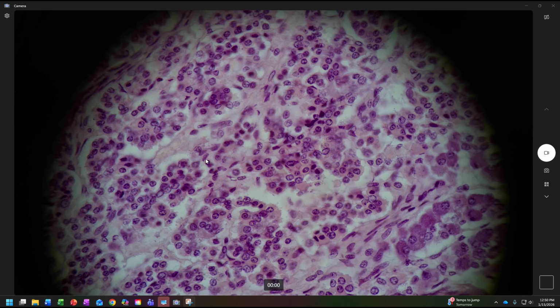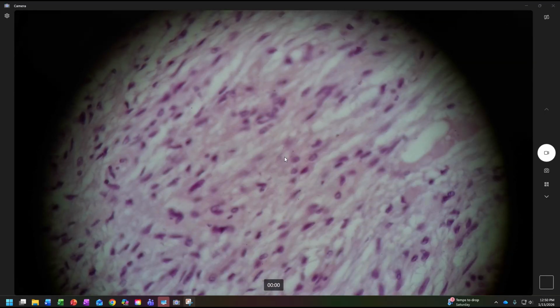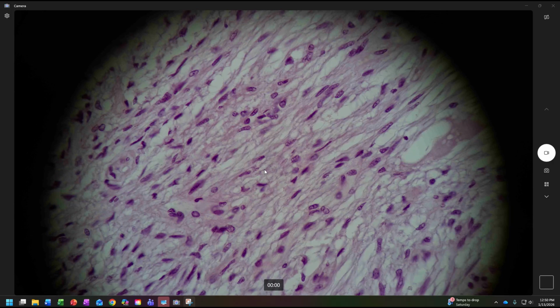Again, these little specks here, those are all individual cells. Those darker ones are the nuclei of individual cells. But we can see they're packed tightly together. That gives them the grainy appearance. That gives them that denser, darker look. And if we go over again, I think it was over this way. Yep, there we go. Again, we can see the wispiness. Again, cells not so packed tightly together. Therefore, that gives that a lighter, less dense look. It's a little more wispy than grainy, and this is a posterior pituitary gland.